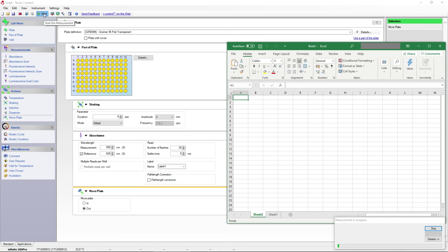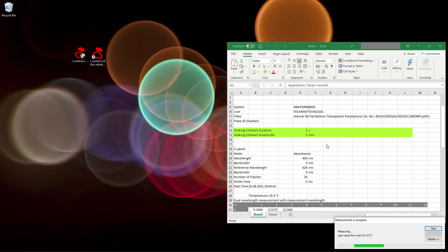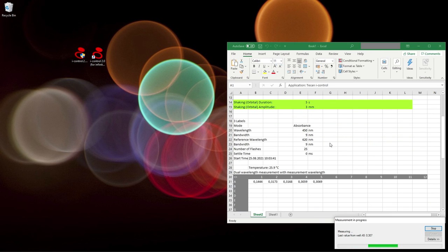Now we are ready to start the measurement. The iControl software will export your data to an Excel file that you can save to view and analyze your data at any time.